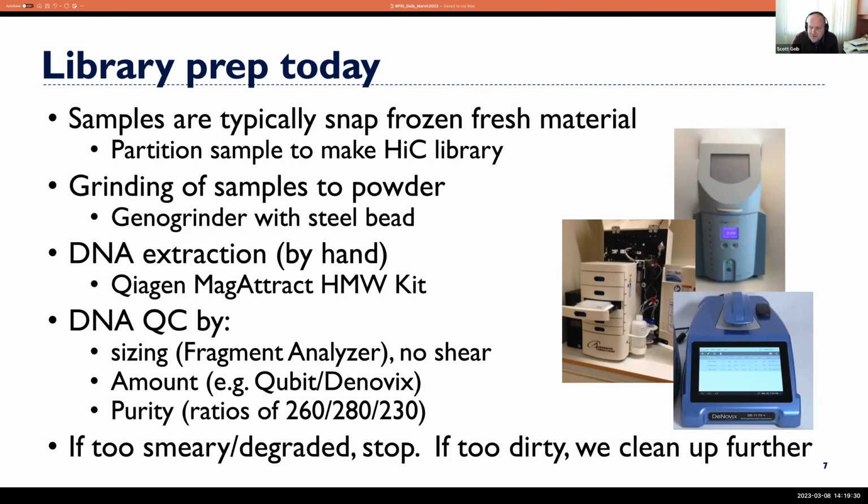We also use, you can write this down if you want to, Millipore Amicon Ultra protein purification columns. Those work very well for DNA cleanup. Effectively, you would put your sample in there, fill it with water, spin it through, fill it with water, spin it through, fill it with water, spin it down to the dead stop. You seem to lose very little DNA. You get no degradation of the DNA, and it's quick. The downside there is those columns themselves are $10 to $15.